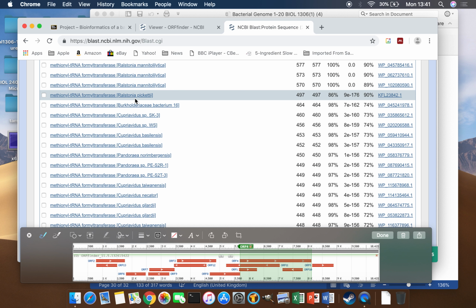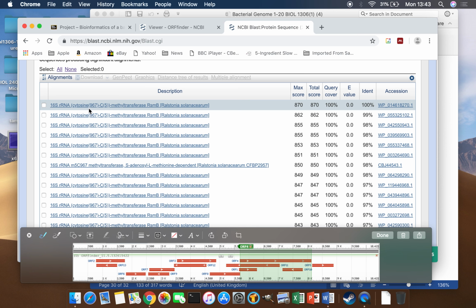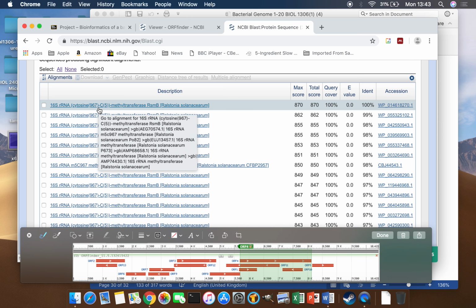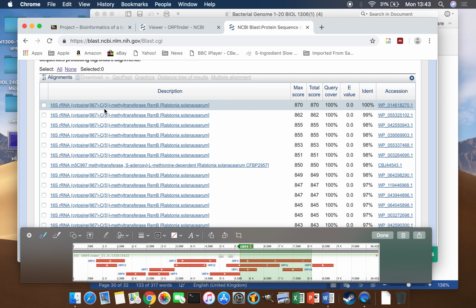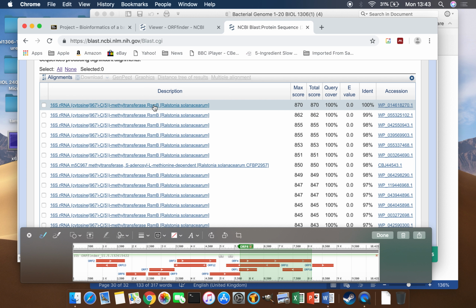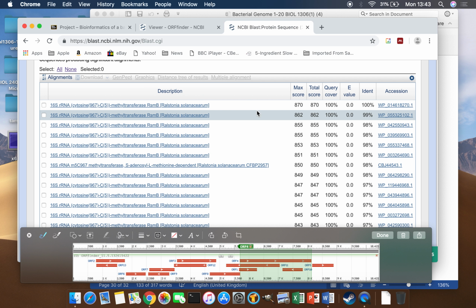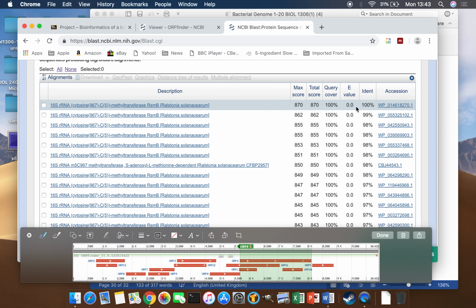Well, the 16S ribosomal RNA, one of the RNAs that make up the ribosome, has a cytosine, a C nucleotide, at position 967. It's a big, long RNA. And on that thing, at the 5th carbon, we're going to add a methyl group with this particular enzyme. So it's super specific. And actually, before we could even look at that, we should go over here and say, what's our E value, our chance of error? And our chance of error is, again, 0, and so I'm confident.